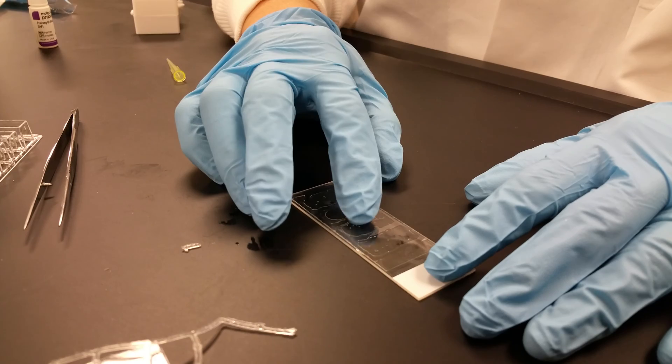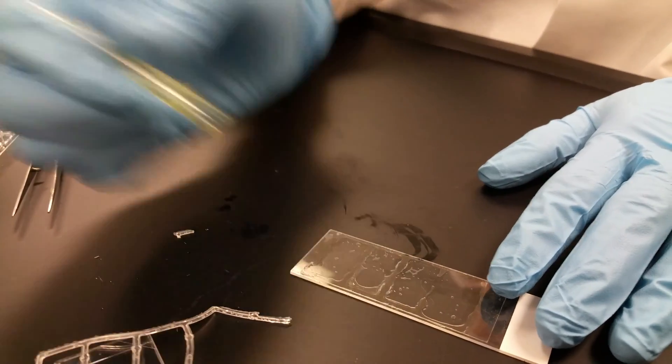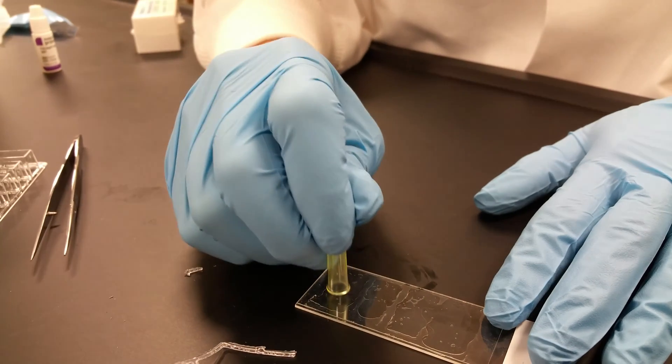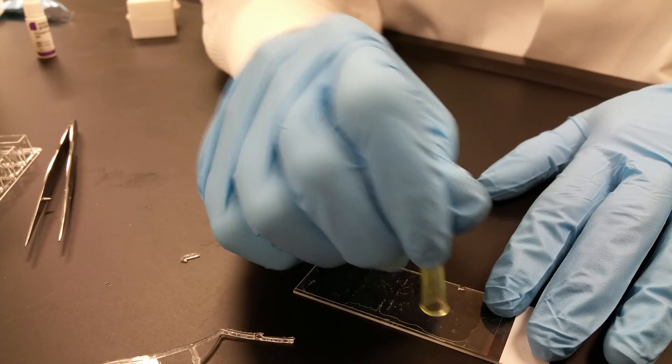As you can see, I still have some bubbles. A way to get rid of that is again to take a pipette tip and just sort of press it down, and the bubbles will move to the side.